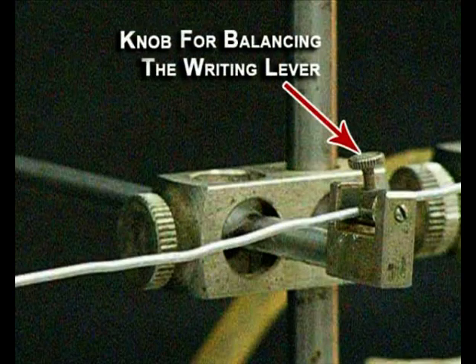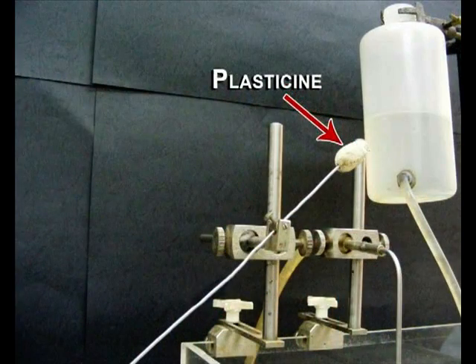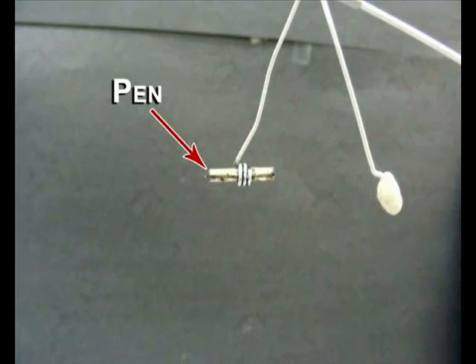The knob is used to balance the right hand lever with the help of plasticine. At the tip of the right hand lever is the pen.